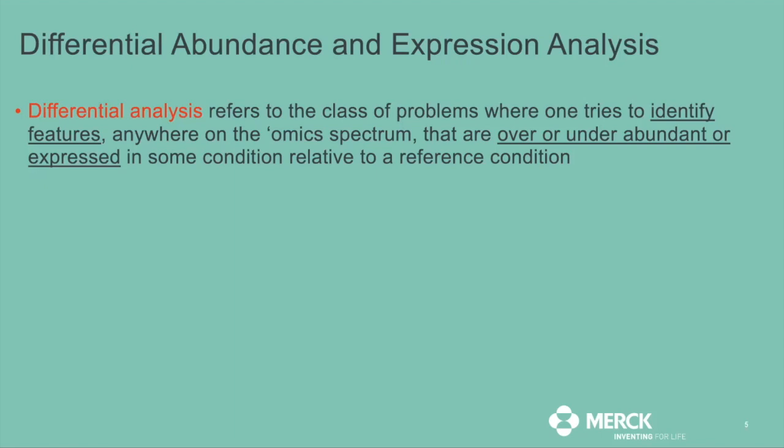So I'll summarize by saying at the core of the problem is differential analysis. I know that we are possibly all familiar with the term, but what I have done here is reintroduce differential analysis by combining differential abundance and differential expression. Differential abundance is usually more popular for DNA-based measurements, and similarly, differential expression is more popular for RNA-based measurements. In the microbiome community, differential abundance analysis is possibly the most common form of analysis, as compared to, for example, RNA-seq literature from the host side, where differential expression analysis is the most common, especially in a two-group scenario of cases and controls, which is the simplest scenario.